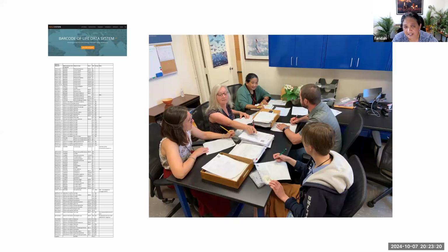So see this slide of Excel, it has our barcode number, the real number from the example that we got, the species, genus and species, and the percentage that it presents itself when we do the sequencing. The lovely thing about this is we all sit together and it's kind of like a family day. After we sample, we put the case back in the freezer. When we have 96 with IDs, we all sit down with pencils and look at whether the ID matched what is in the bag.